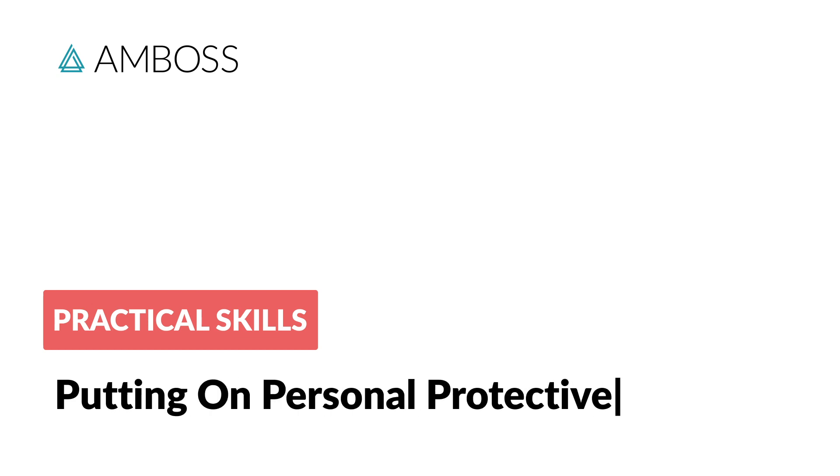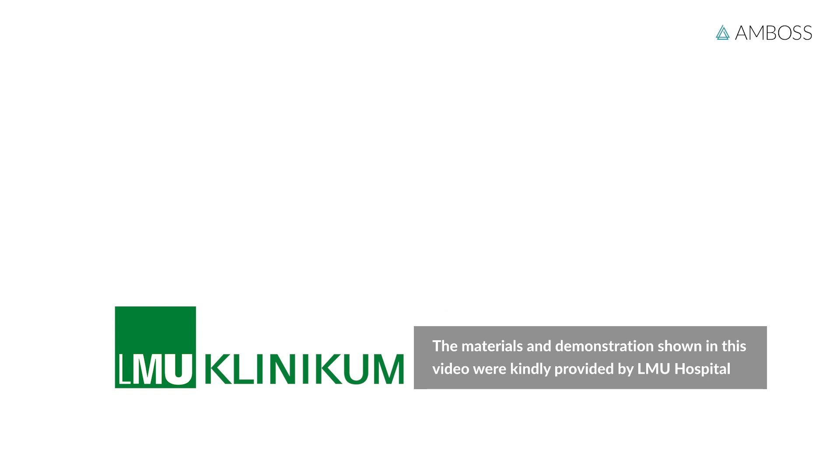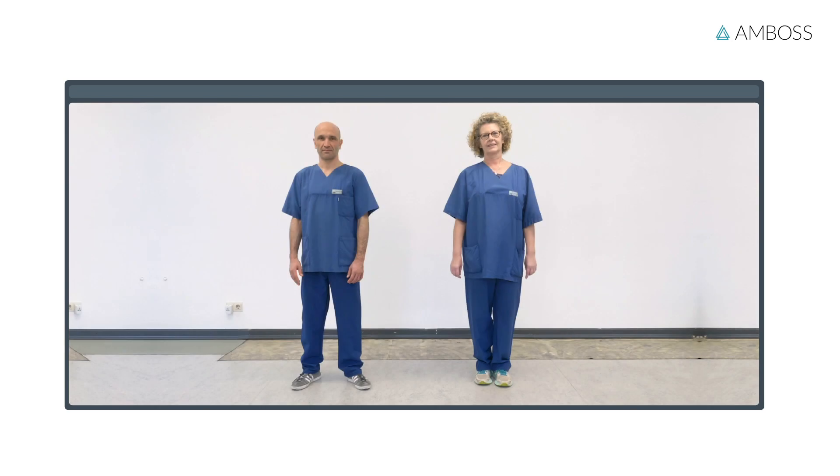How to put on personal protective equipment using a case of suspected COVID-19 as an example. In this video, we will use healthcare equipment with particular design features. The equipment used in this video may differ from that available to you. The proper method of putting on personal protective equipment will be demonstrated by Daniel and Marie.